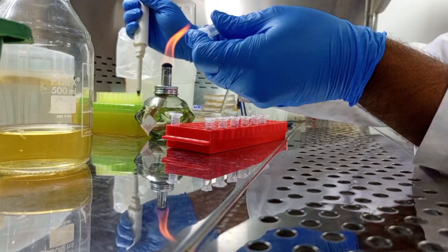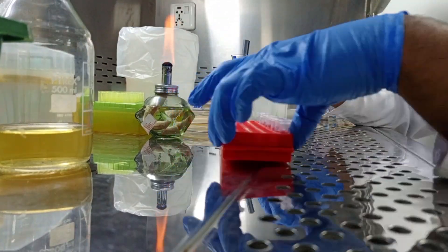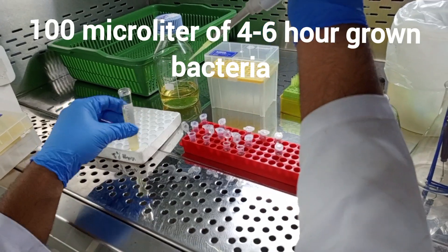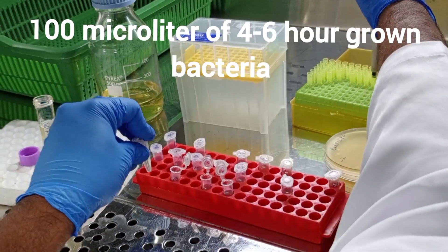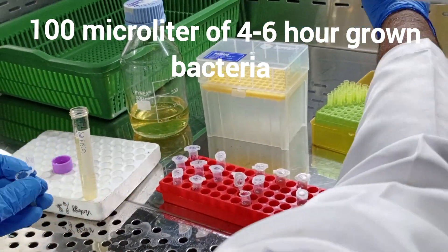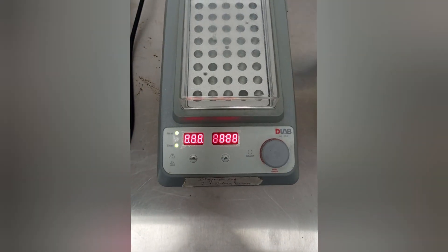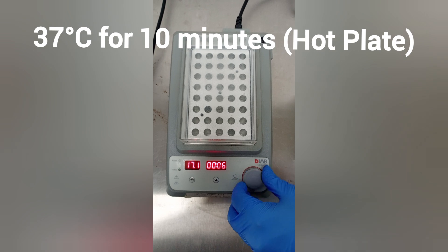From the last tube, discard 100 µl of solution, and this is how you complete your serial dilutions. Next, add 100 µl of 4 to 6 hour grown bacterial suspension into these dilutions and mix well.